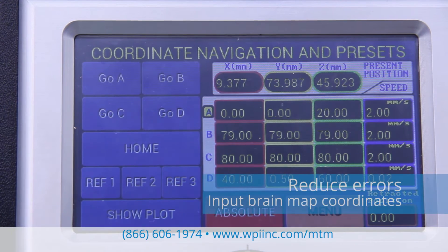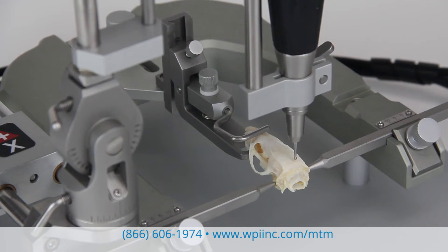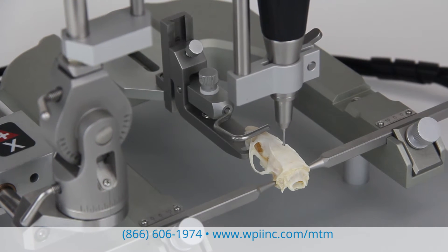You can directly input specific brain map coordinates, eliminating coordinate calculations. The MTM3 controller performs all the necessary calculations and stores the calibration data.